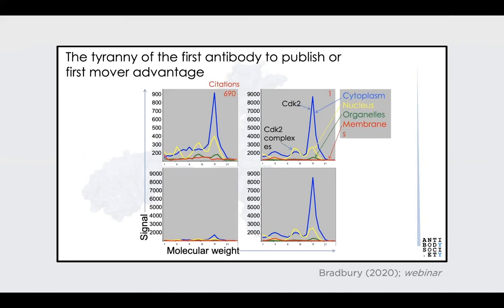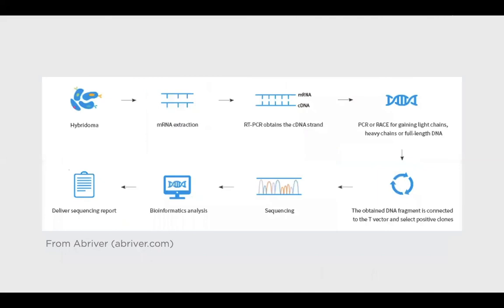So researchers are typically just choosing the first antibody to be published, and they use that over and over again. Researchers are producing irreproducible results just because there's no good way of characterizing these antibodies. There's just so much unknown there that researchers can't control whatsoever, and the industry really hasn't stepped up to address this issue.